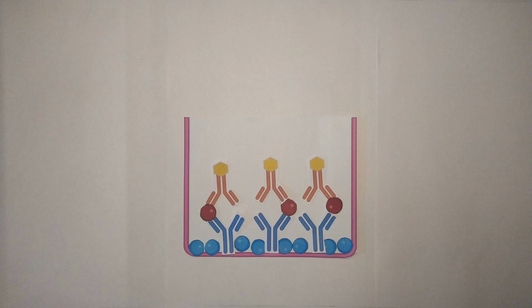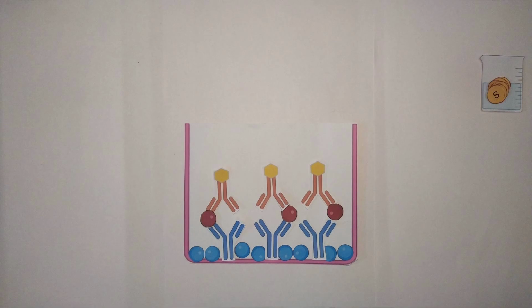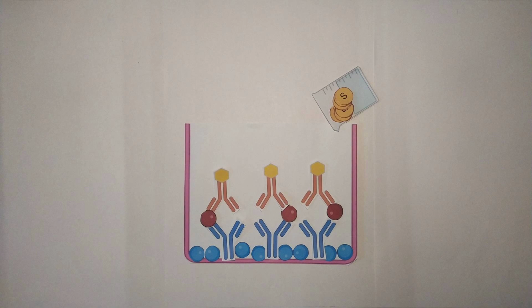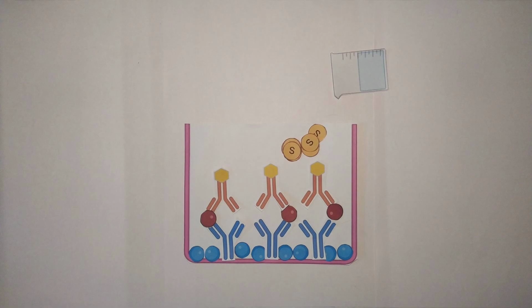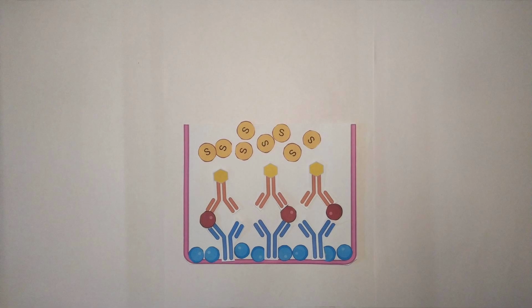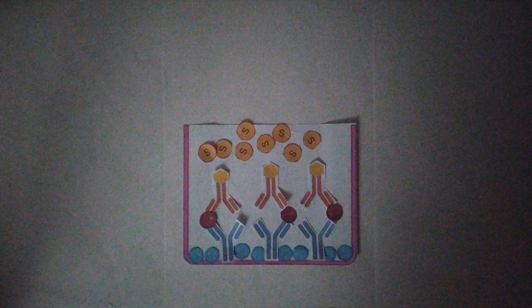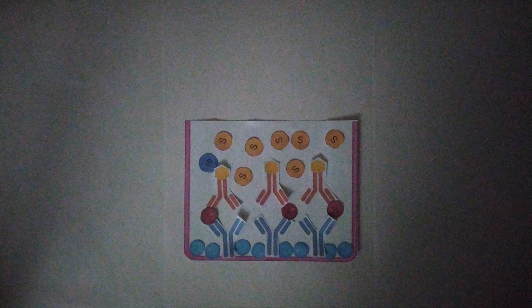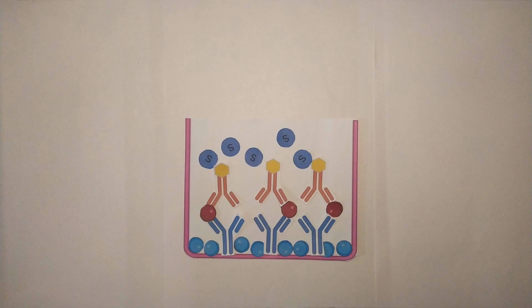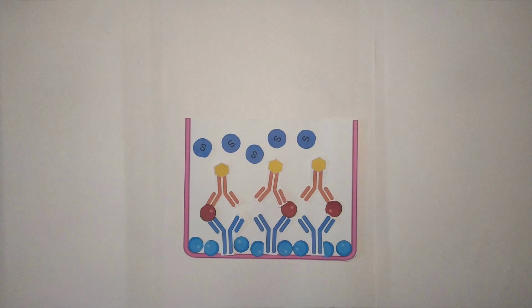The fifth step is addition of substrate. In this step, the substrate for the specific enzyme is added. In this case, the substrate is TMB-H2O2. This is then incubated in the dark for 10 minutes. During this, the substrate reacts with the enzyme to give a colored reaction. For example, TMB-H2O2 reacts with horseradish peroxidase to form a conjugate TMB-O, which is blue in color.